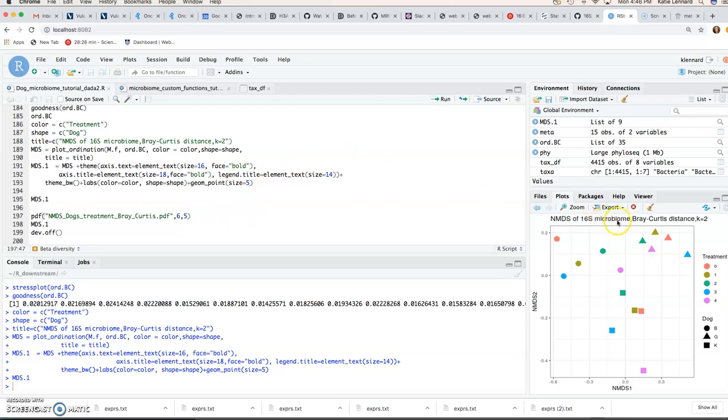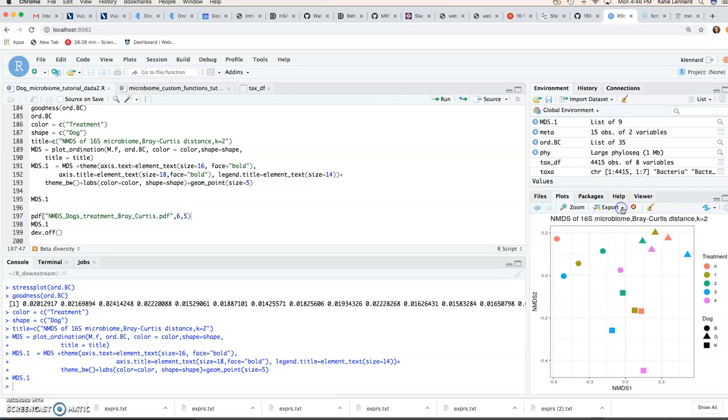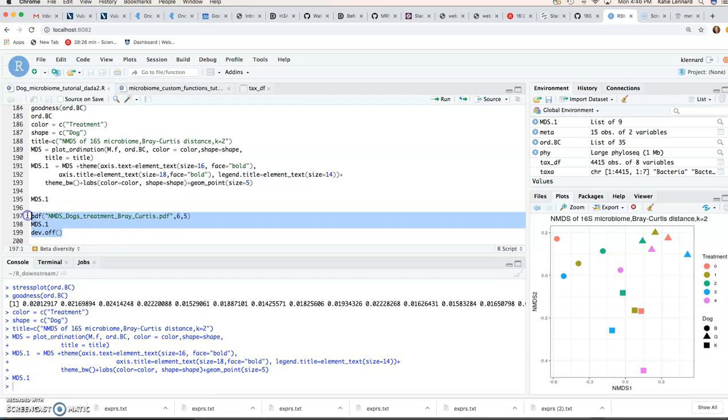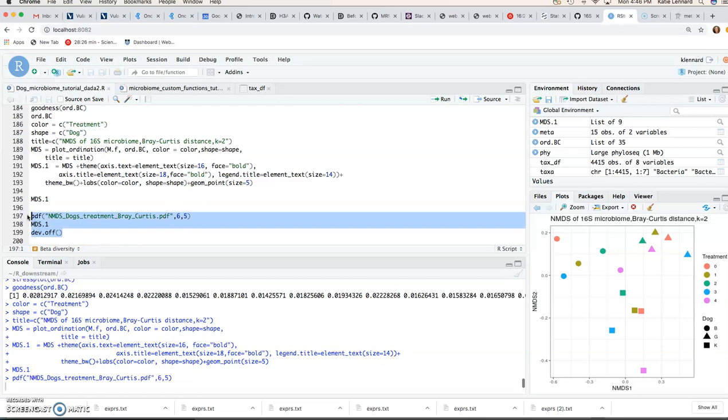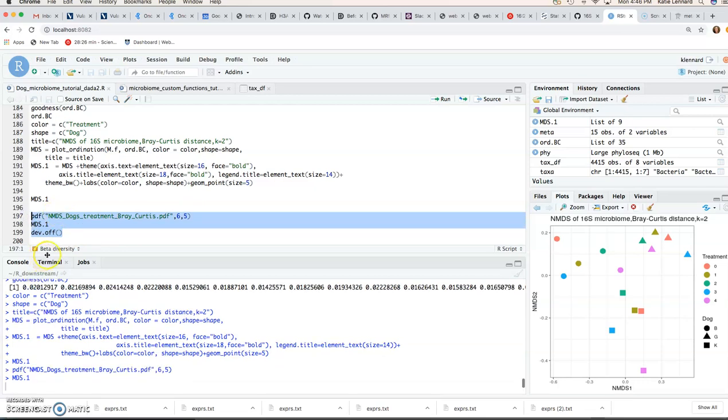So we've got the plot here. So your one option is to export from here. But you can also use the PDF function where you name your plot. You pick the size of your plots in width and height. And that'll write that to your project directory.